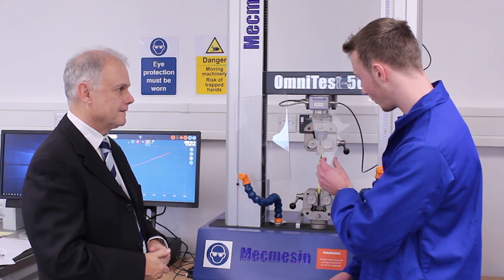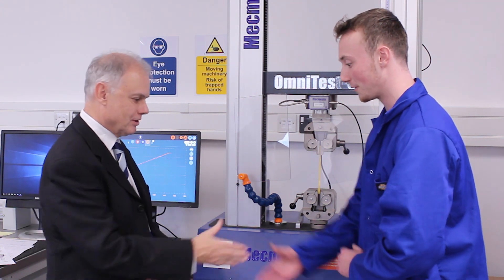Count on Mecmesin to be your trusted partner for tensile and compression testing. Contact us.